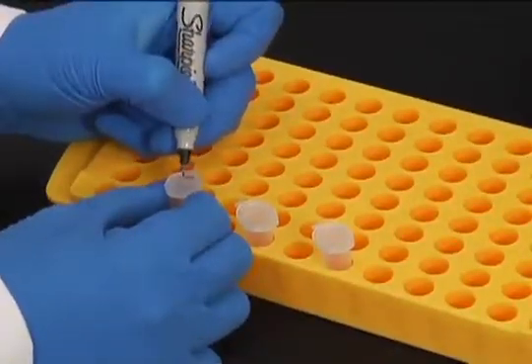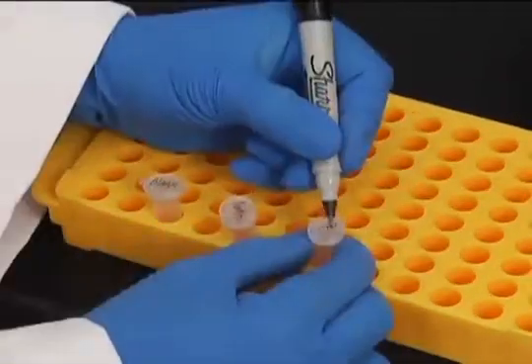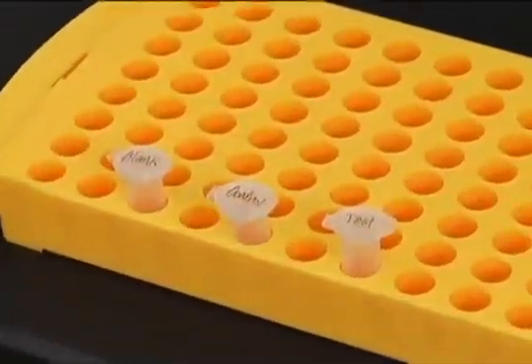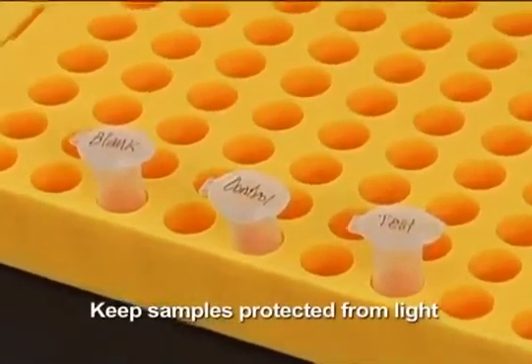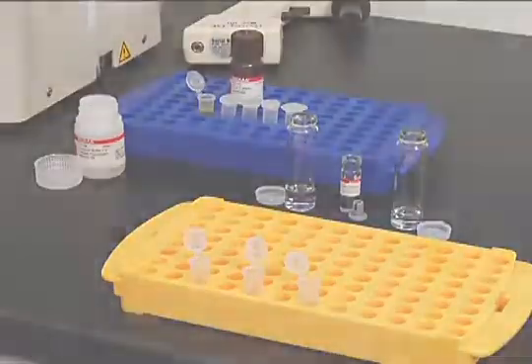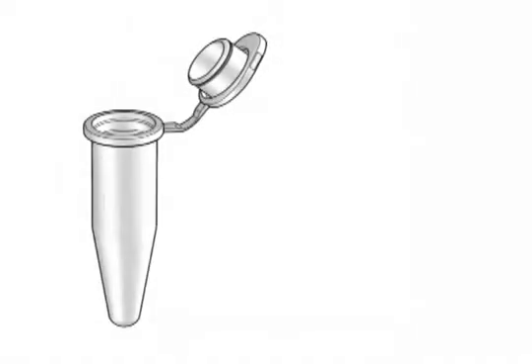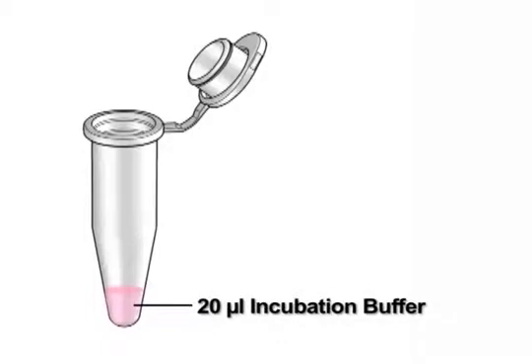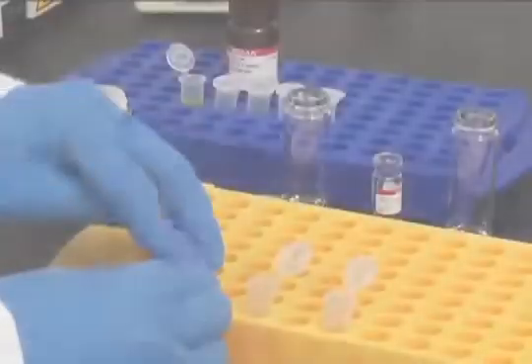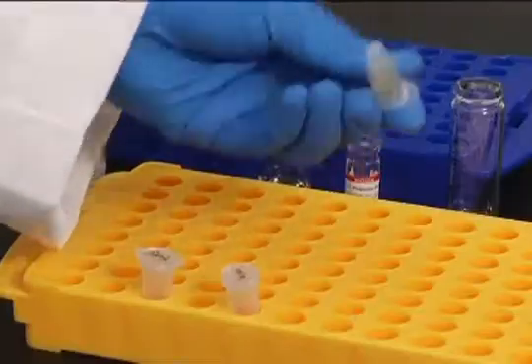Next, start preparing all of the assay samples, which include test samples, trypsin control, and blank. Throughout the assay, keep the samples protected from light. For each test sample, combine in a microcentrifuge tube 20 microliters of incubation buffer, 20 microliters of the FITC casein substrate, and 10 microliters of the test sample. One may use a clear microcentrifuge tube as long as the sample is incubated in the dark. Note also that test samples which have high protease activity will need to be diluted.